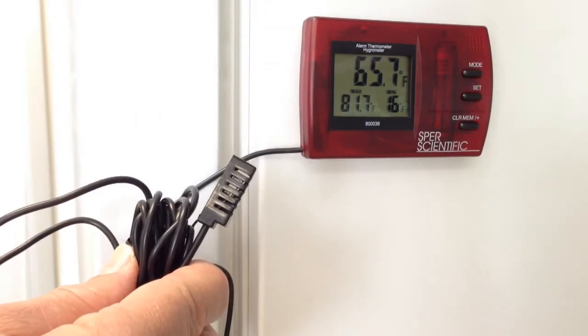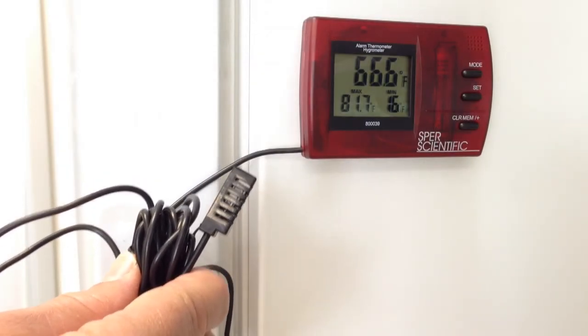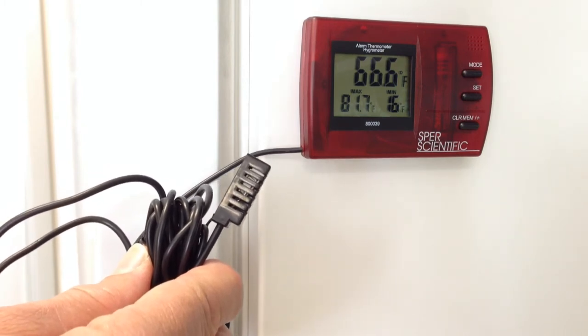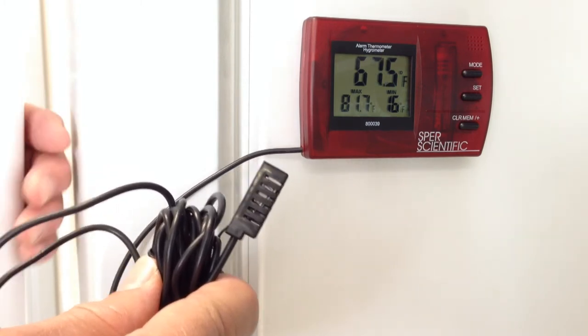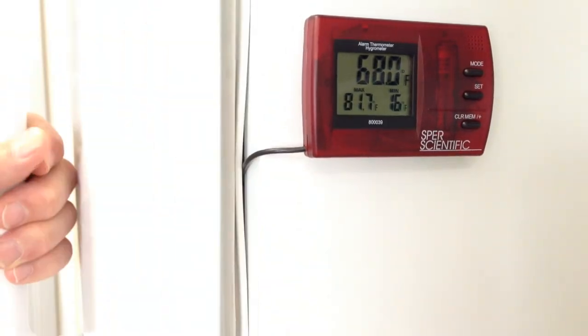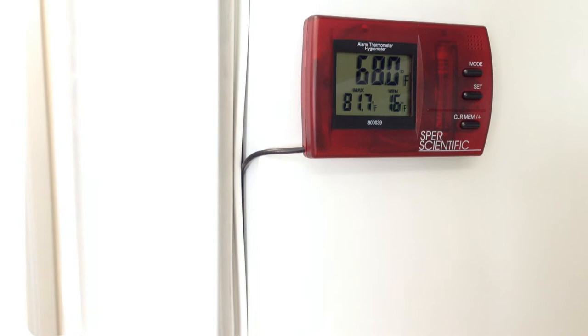Model 800-039 features a remote temperature and relative humidity sensor mounted on a seven foot cord. Place the highly accurate sensor inside a desiccator, refrigerator, drying, or other environmental chamber and view displays of temperature, RH, together with their min-max readings on the monitor outside.